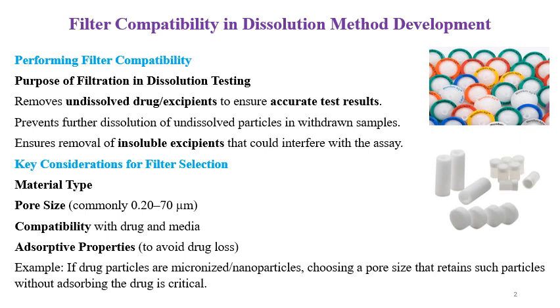Then it ensures removal of insoluble excipients that could interfere with the assay, or you can say with the analysis of the analyte.